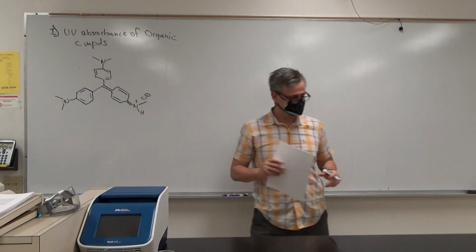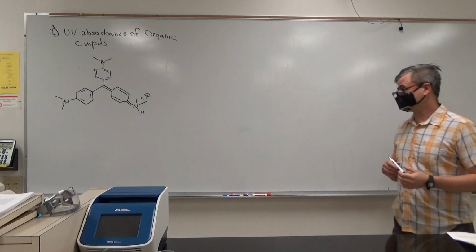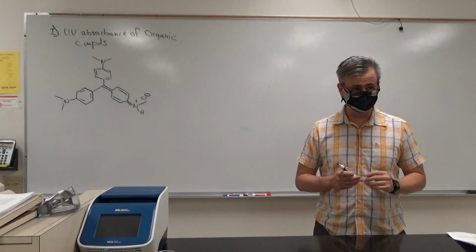Okay, sorry. So that's methyl violet. And we're actually going to be dealing with aqueous solutions of methyl violet.